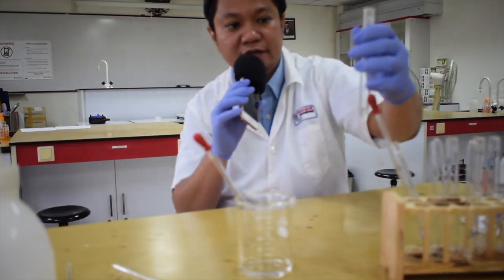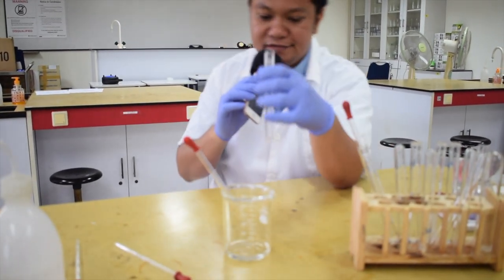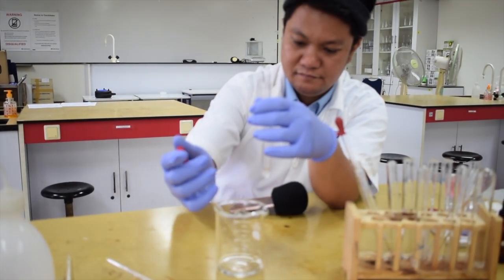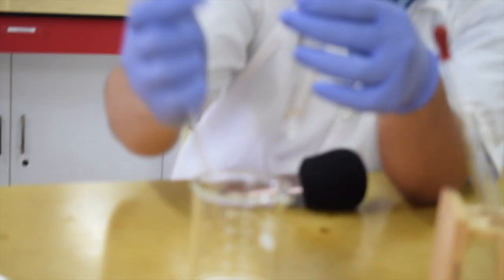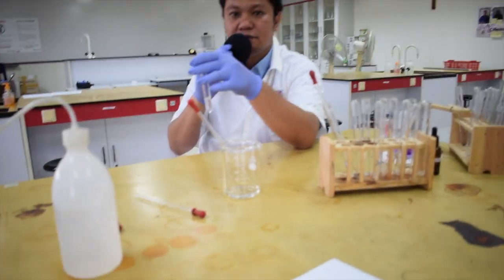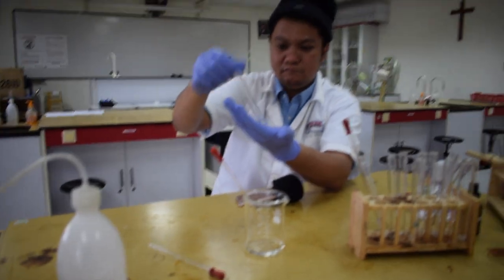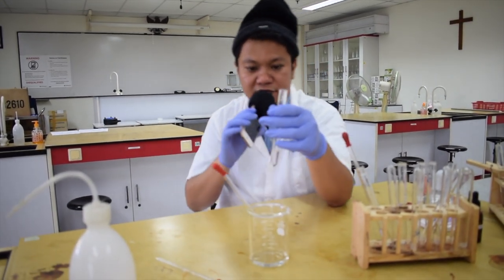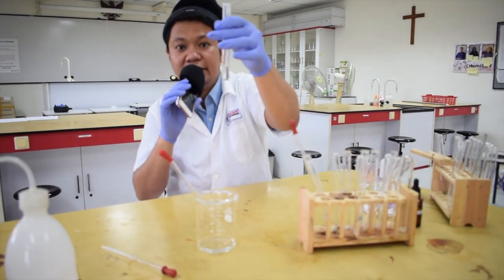I use four times the initial volume of samples as the excess sodium hydroxide, and then we start to shake. As you can see, the precipitate has already dissolved — so you should write down that the precipitate dissolved, or is soluble in excess reagent.